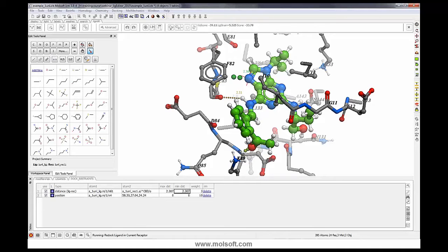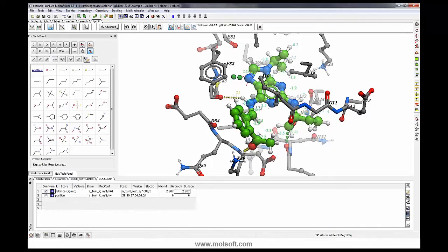It's going to evaluate the energy and build up a stack of energetically favorable poses for this ligand, and soon it will provide a stack of conformations. I've turned it off, but you can actually display the docking as it goes along, though this takes a little bit longer.